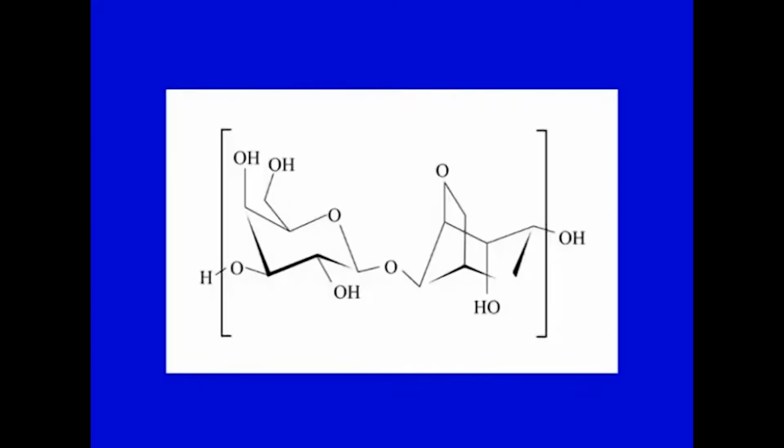Now, this is a simple schematic of the two units which agarose is made of, that is the repeating unit agarobiose. The gelling properties of agarose are attributed to both intra and intermolecular hydrogen bonding within and between the long agarose chains. So, the whole matrix which is formed is due to the hydrogen bonding pattern.